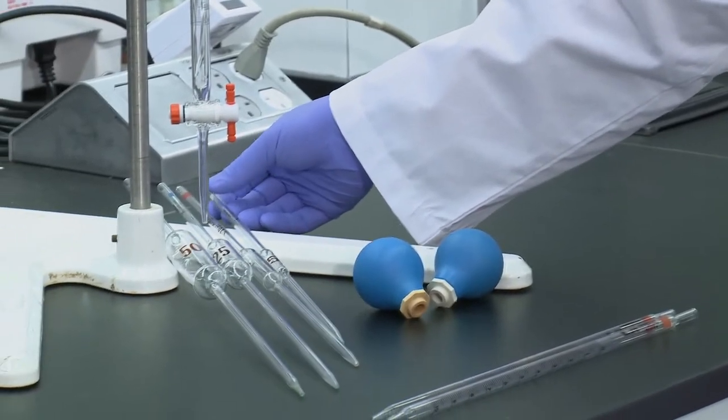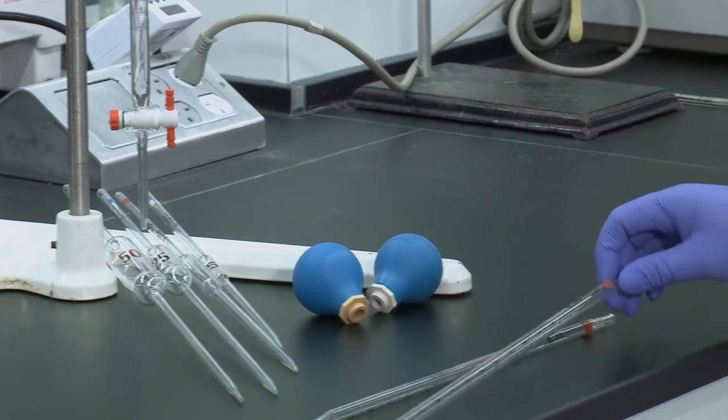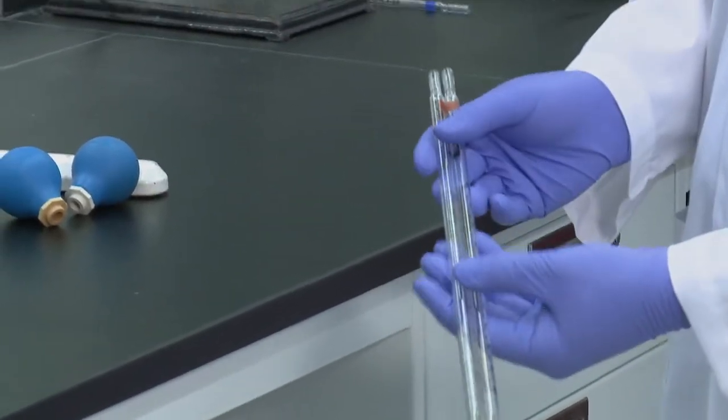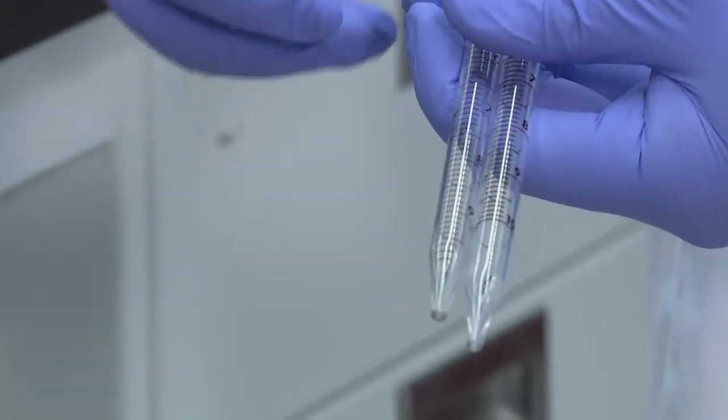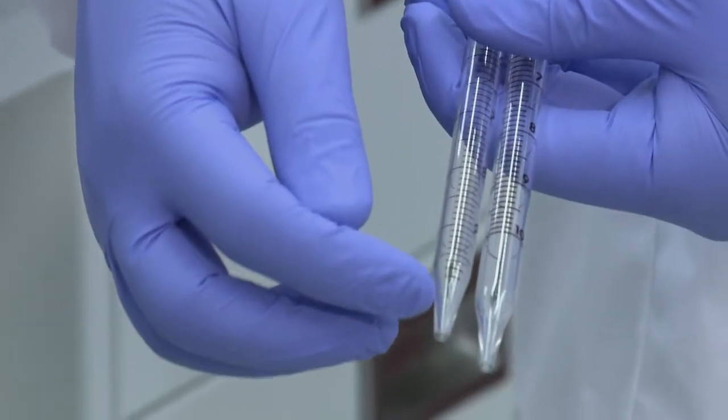If you require a volume that is not associated with one of those pipettes, you have two other graduated pipettes which have a slight difference you can tell by looking at the tip here. On the right we have the serological or blowout pipette where the gradations go all the way to the bottom.